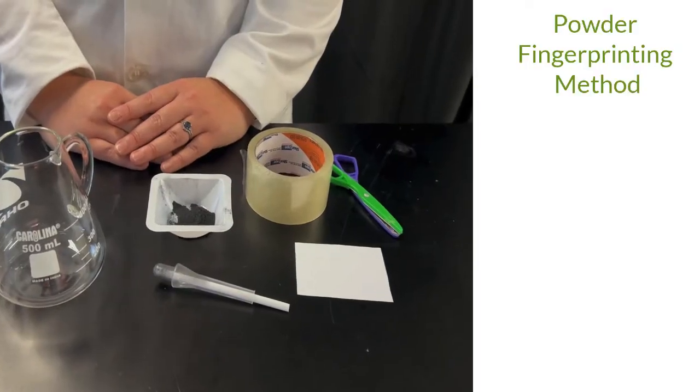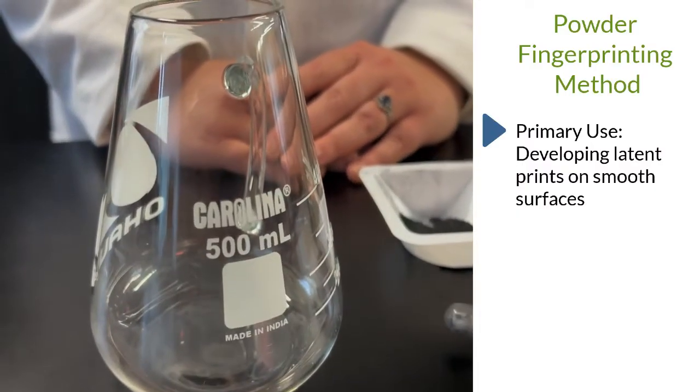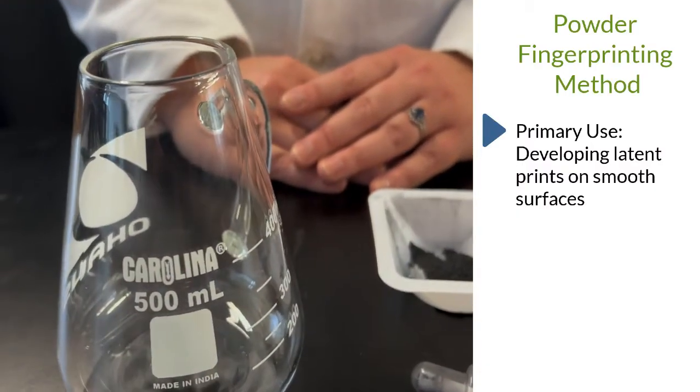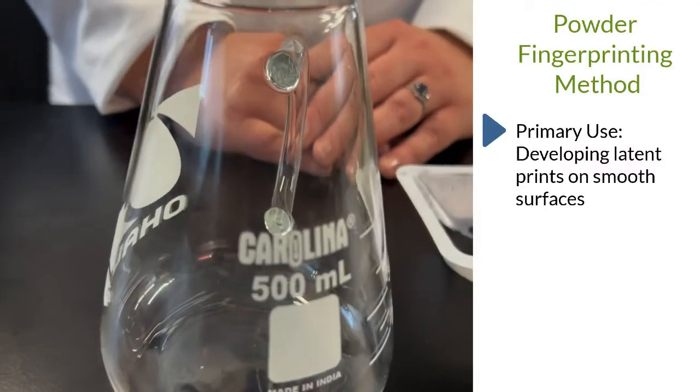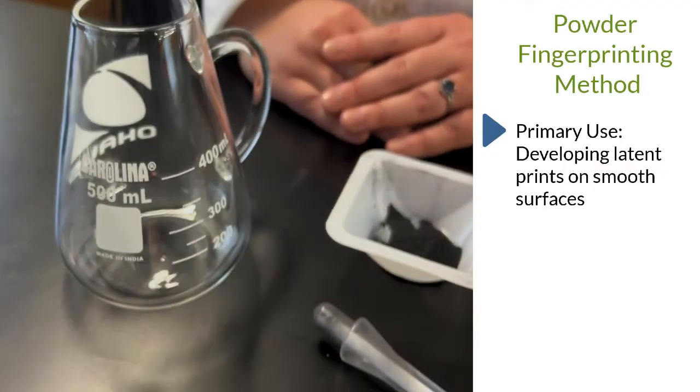Fingerprinting with powders is used for developing latent prints on smooth surfaces such as glass. Applying powders can make latent prints not visible to the naked eye visible and cast prints in a material that can be lifted from a surface for detailed analysis.